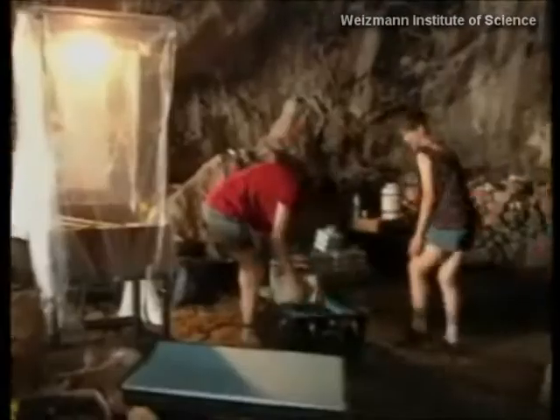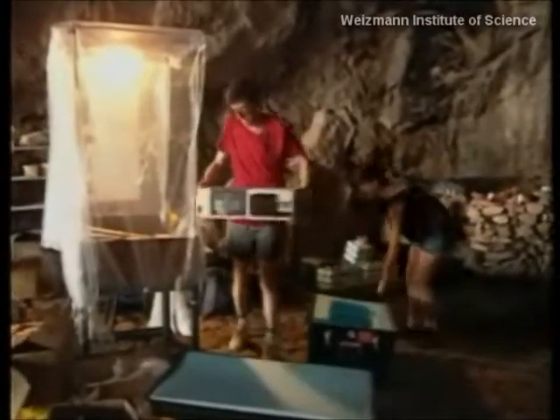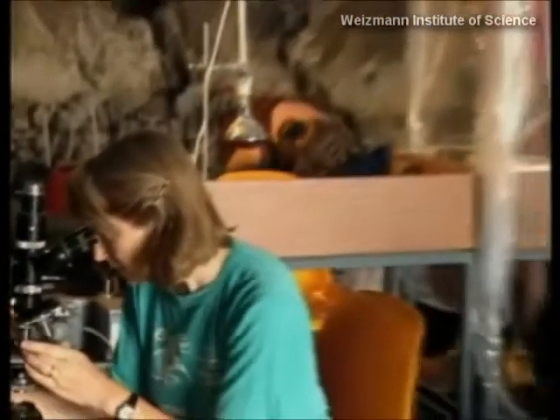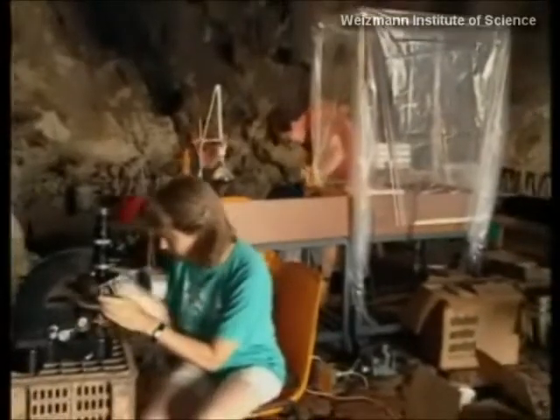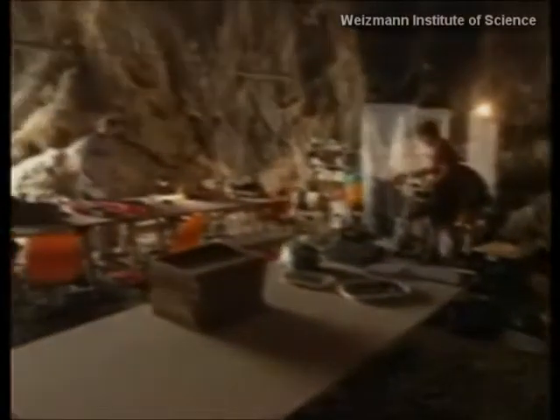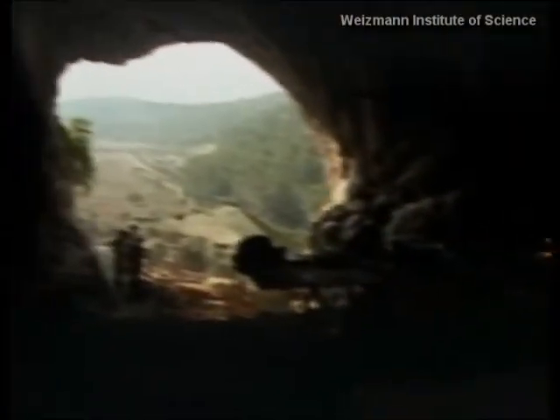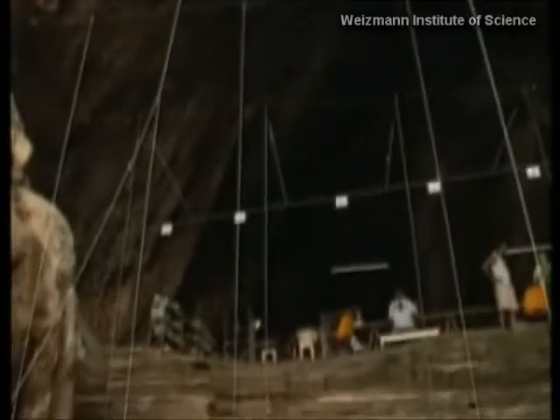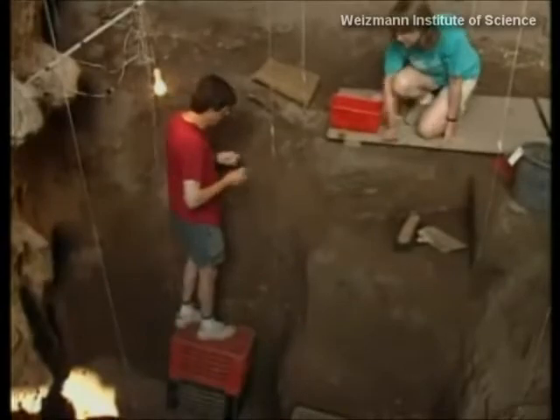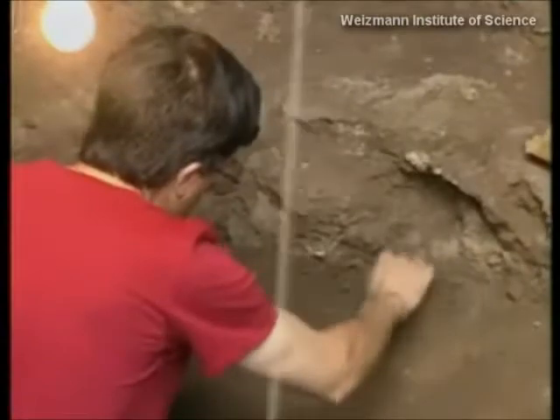A crew from the Weizmann Institute of Science, working together with researchers from the United States and France, is scrutinizing the contents of this site known as the Hayunim Cave. Instead of gathering samples for later analysis, a Weizmann expert in both structural biology and geology, Professor Steve Weiner, has introduced the idea of using a portable lab on site, an original concept that opens new avenues for the study of the ancient past. In particular, the researchers can now study the refuse of past human habitation, such as animal bones and ashes, which offer valuable clues to the lifestyles of prehistoric inhabitants.